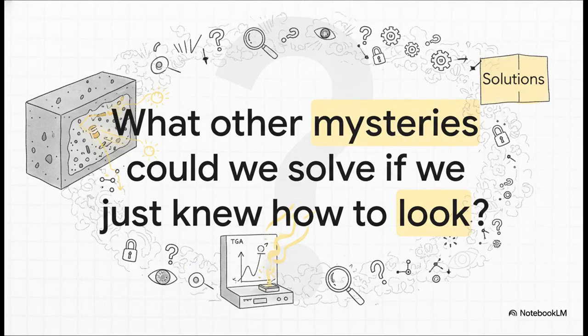You know, TGA is so much more than just a tool for analyzing concrete. It's a way of seeing the invisible, of decoding the chemical secrets locked inside all the materials that are all around us. And it really makes you wonder, doesn't it? What other mysteries are out there, just waiting to be solved, if we just find the right way to look?